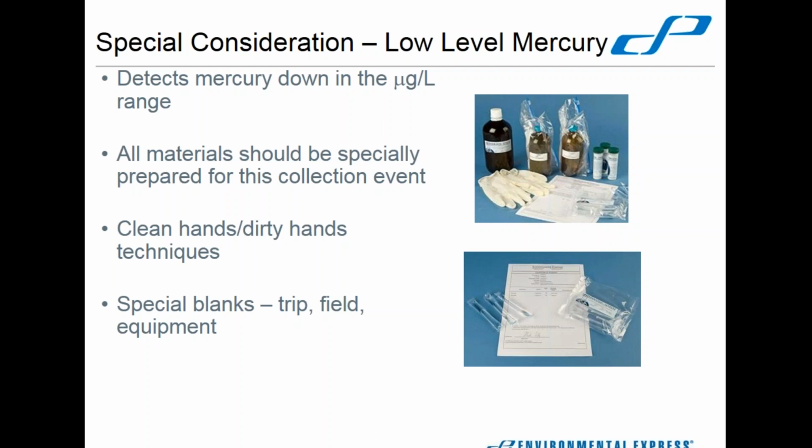So there's lots of things that you have to take into consideration for low-level mercury. Often I've seen people gear up in full Tyvek suits to keep anything that may have collected on your clothes from potentially getting into the sample. So lots and lots of things that you have to do to make your low-level mercury sampling event a success.